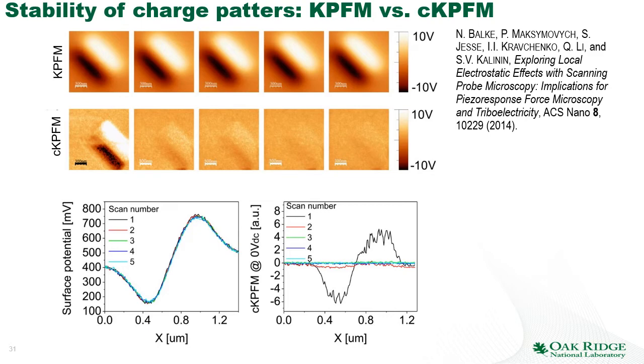If we try to do these measurements with the CKPFM, you can see that we measure strong contrast during the first scan, and then the contrast disappears. This happens because in the CKPFM, the readout is destructive. We basically zero out the surface state. So this is a spectroscopy that allows us to measure surface charging, and the charges can be exchanged between the tip and the surface.